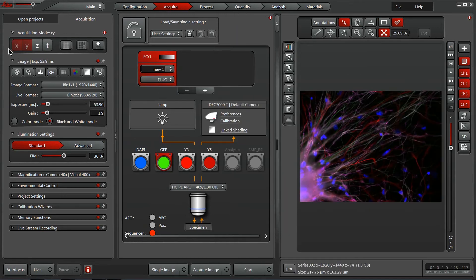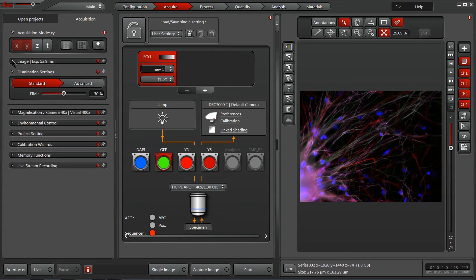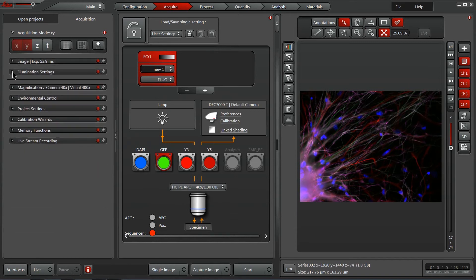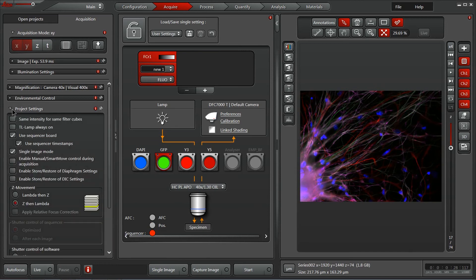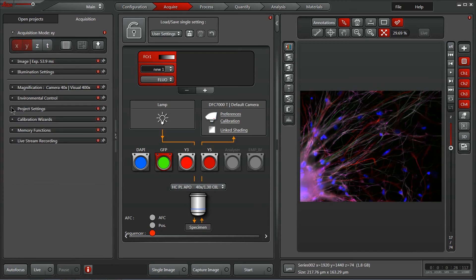Last but not least, on the left panel, each of these options here have a caret next to it, which allows you to expand or hide that menu, making it nice and easy to navigate through all the choices available to you without having multiple windows open.